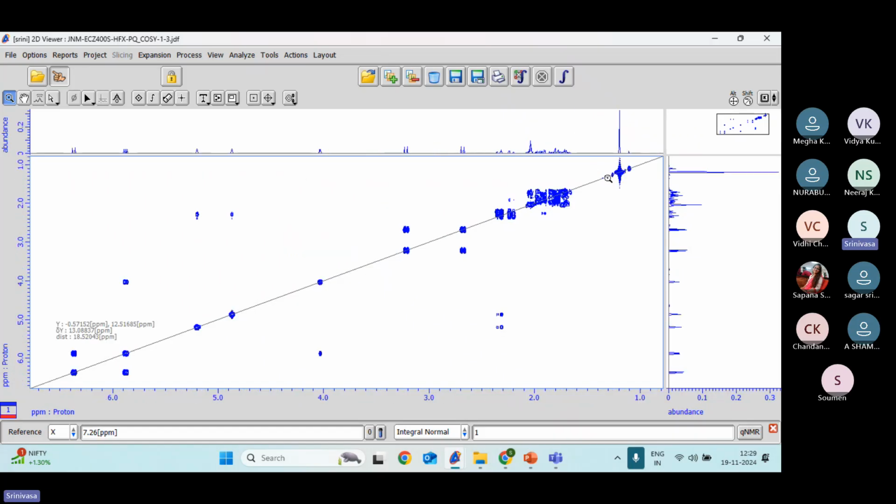Zoomed. Okay. And if you want to remove the line, go again to the measurement. Now blue indicates this line got selected. On the keyboard, press the delete button. That is removed.